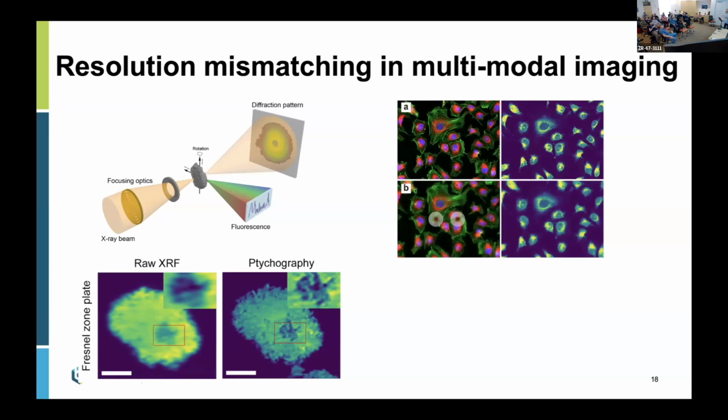So in a simple way, the fluorescence measurement can be modeled as an integration of the illuminated sample area. Clearly, this integration will have a limitation on the beam size, and is also determined by the scanning steps we're using for this measurement process.